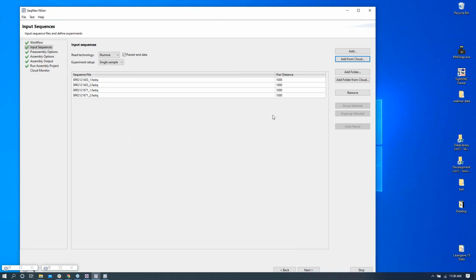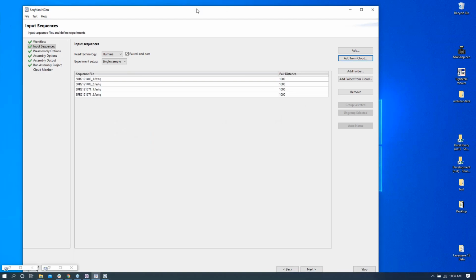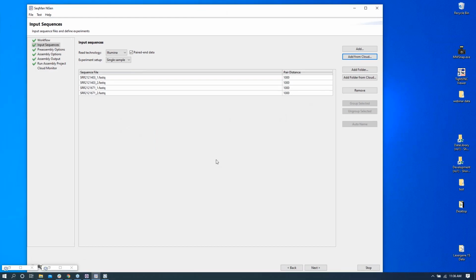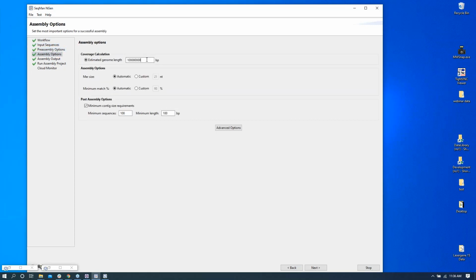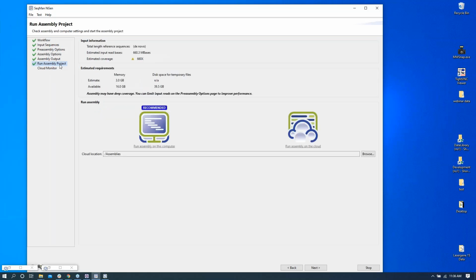And the download speeds are a lot faster typically than uploads. So that's not as much of an issue. Now, I will say that you may also be able to run, if your laptop has 16 gigs of RAM, if I go back and do smaller genomes, if my genome was much smaller, then the estimate is going to be well within 16 gigs of RAM. So again, depending on the computer that you're working on, this assessment page here will be flexible.